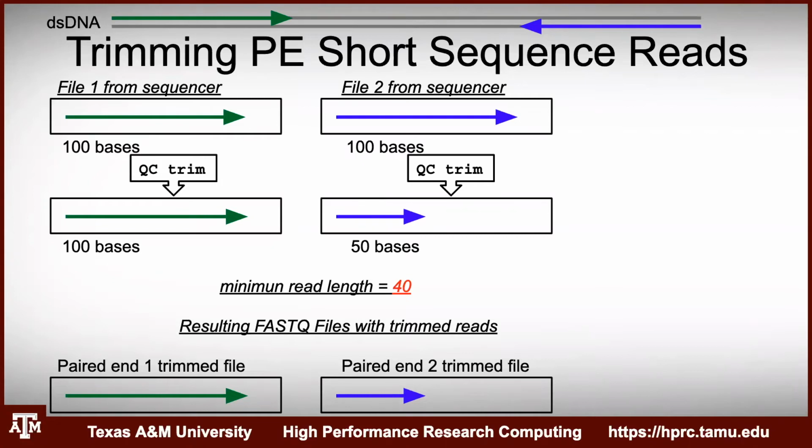Towards the end of that, because they're adding nucleotides to the flow cell, washing and doing all that, it starts to build up noise. So the sequencing quality tends to go down towards the end of the run, especially when you're doing much longer read lengths, like MiSeq 2x250 or 2x300.